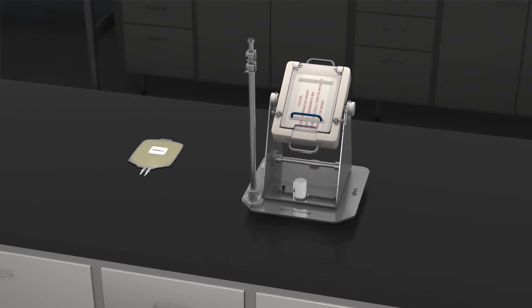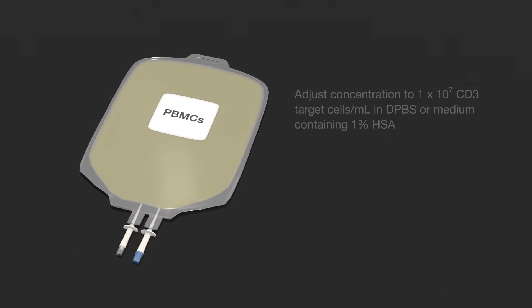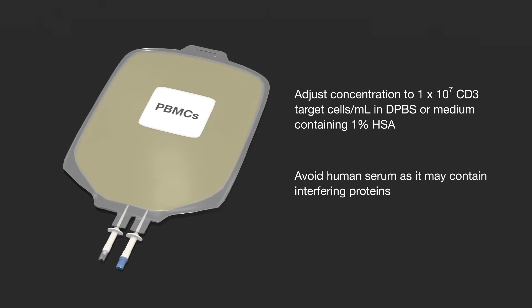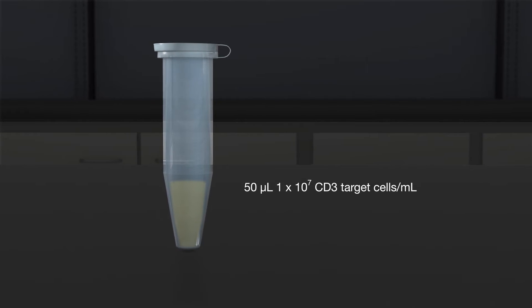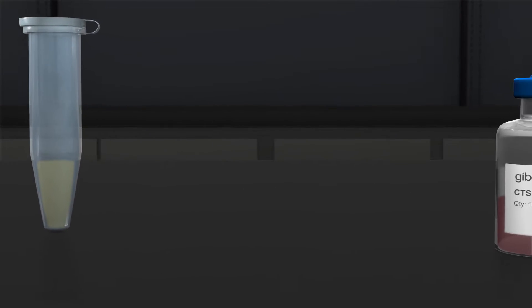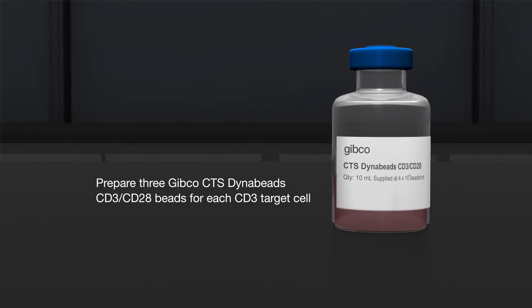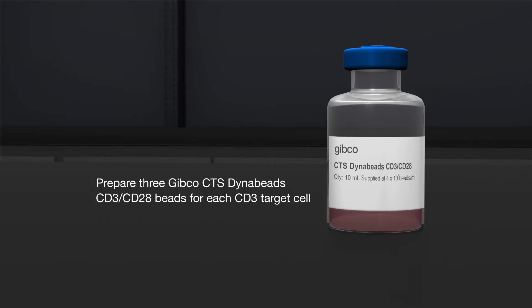Begin with fresh or thawed peripheral blood mononuclear cells or PBMCs. Adjust the concentration of CD3 target cells. Retain 50 microliters in a separate tube for the calculation of recovery later. Prepare and wash Gibco CTS DynaBeads CD3, CD28 per their specific instructions in an amount of 3 beads for each CD3 target cell.